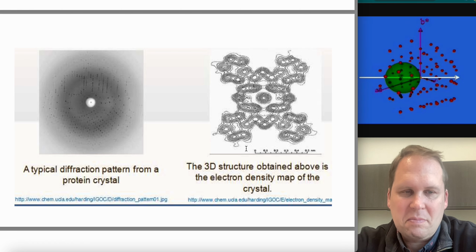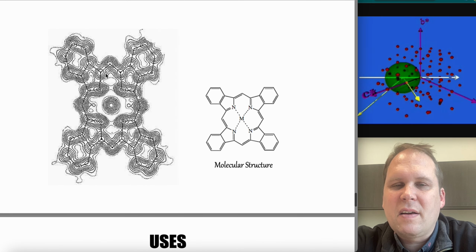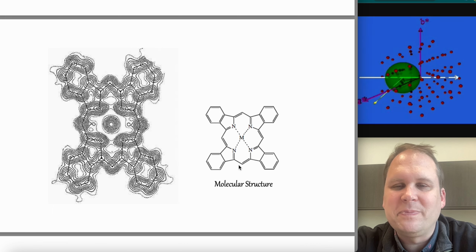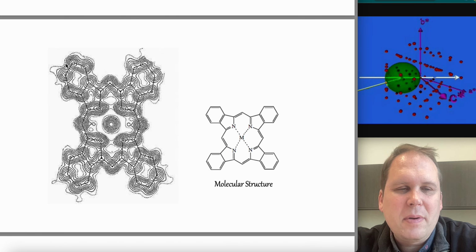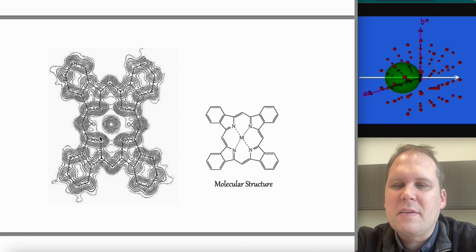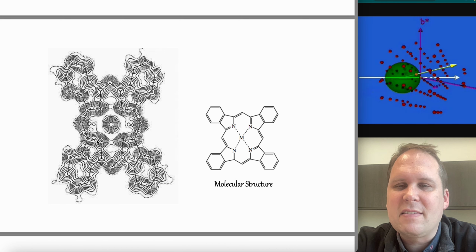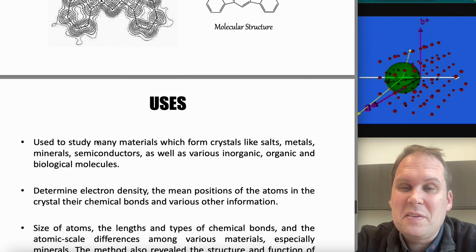And then from that, you can begin to try to refine your structure. And so there's our map, and we needed to phase this in order to solve it this far. And there's the structure of the thing we were trying to solve, and so there you go. It's a good match. The lines in here are like a topographical map. So if they're closer together, it's like height. Imagine these as little hills, little bumps. It's just little mounds of electron density, which is what atoms kind of are. Yeah, because that's where the electrons are to be found.